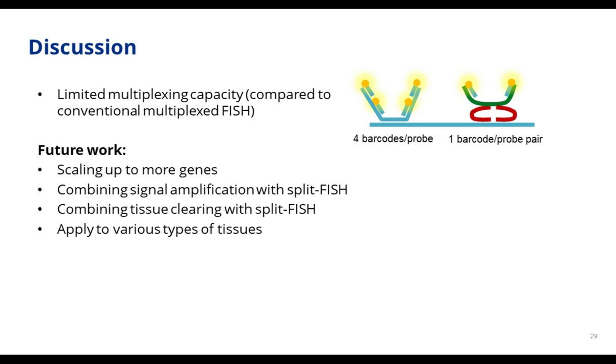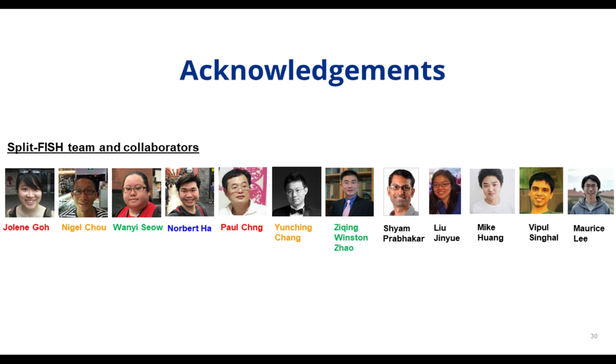I think more work needs to go into SplitFISH to allow it to scale up to more genes. And we are also working on trying to introduce signal amplification or tissue clearing to further improve the performance.